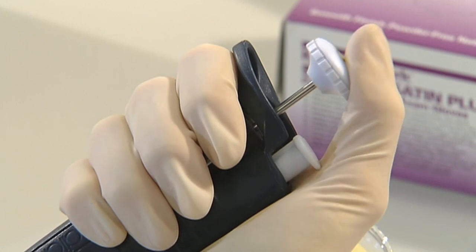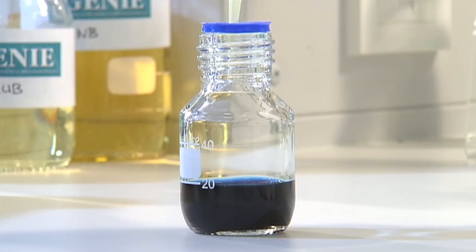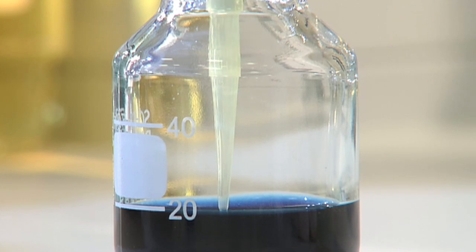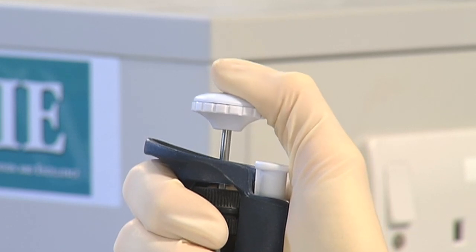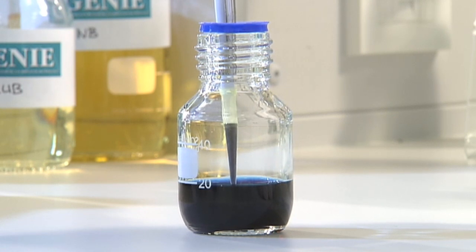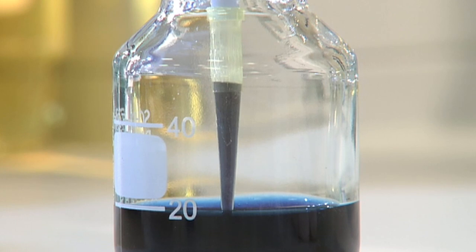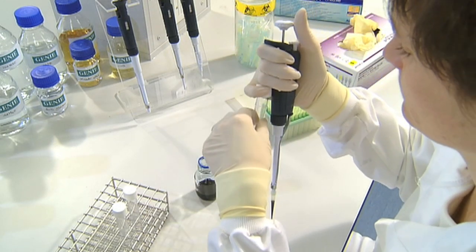To use the pipette, push the button down to the first stop. Then, keeping the push button at this level, place the pipette tip about 2mm into the liquid you wish to draw up. Release the push button by slowly allowing it to return to its original position. Pause for a second to make sure all the required volume of liquid has been taken up into the tip — this is especially important with more viscous liquids, which take longer to draw up.